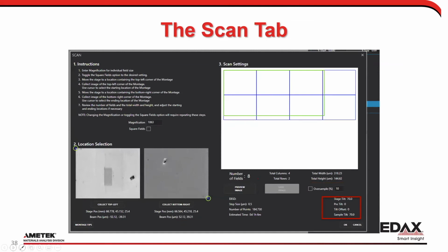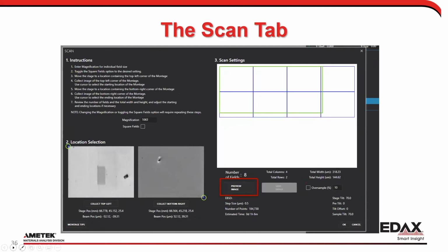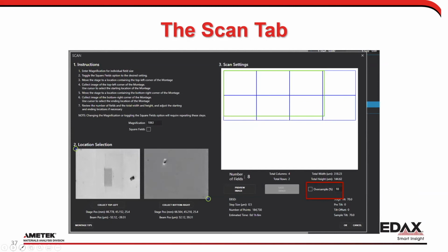I just kind of went through these, but there's also the ability to oversample. The ability to oversample will basically not save the data as one giant hunk of data. It'll save it as a bunch of individual files, so be aware of that. Basically, that's assuming that you think you're better at stitching than we are. It basically says you're going to do it in our software or somebody else's software. But it does oversample the data.